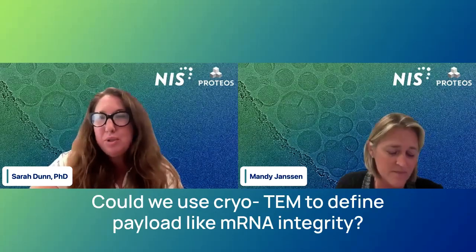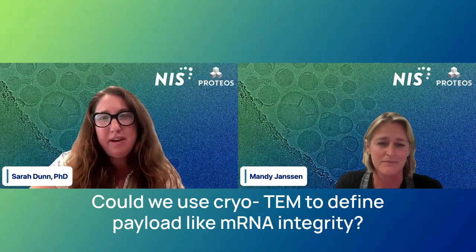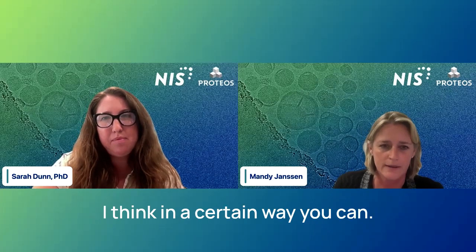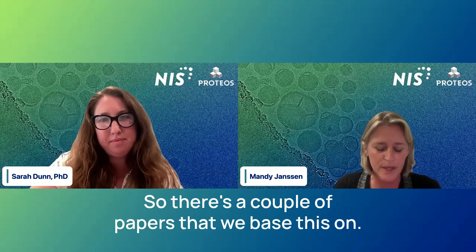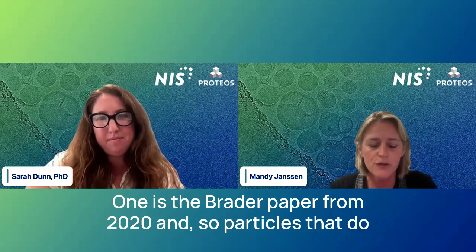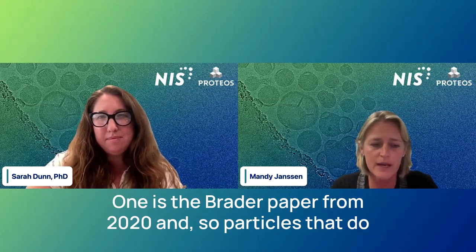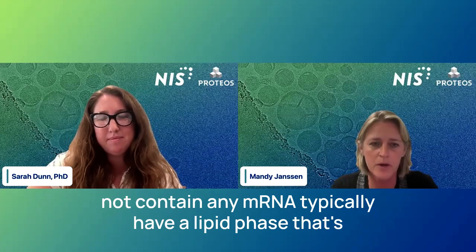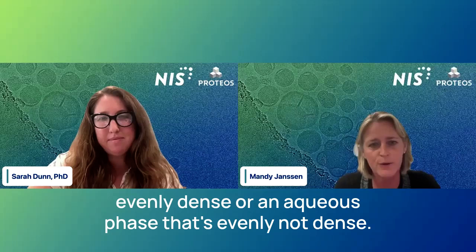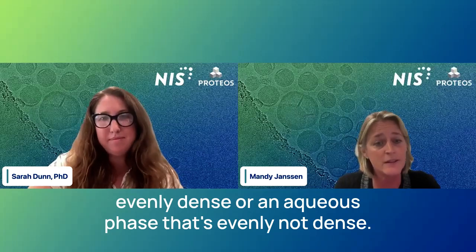Awesome. Could we use cryo-TEM to define payload like mRNA integrity? I think in a certain way you can. There's a couple of papers that we base this on. One is the Brader paper from 2020. Particles that do not contain any mRNA typically have a lipid phase that's evenly dense or an aqueous phase that's evenly not dense.